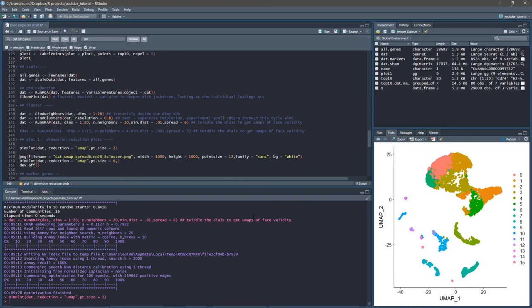So that's essentially how to take some publicly available data, run it through a very basic single cell script, generate some graphs, differentially express genes, classify the cells. You could then share this at a lab meeting, or if it's your own data, this would be a useful figure 1. Obviously I've glossed over all of the math and statistics, and I haven't gone into any great depth about any of the functions really.